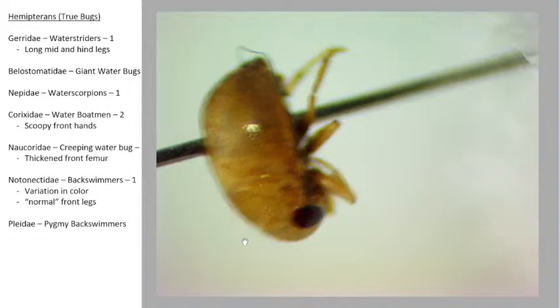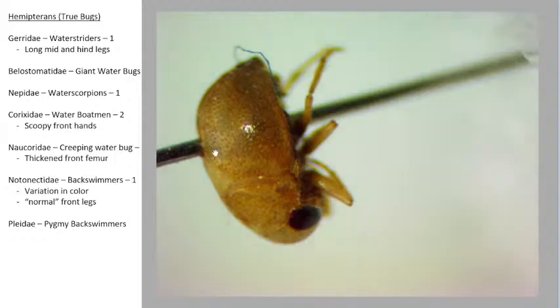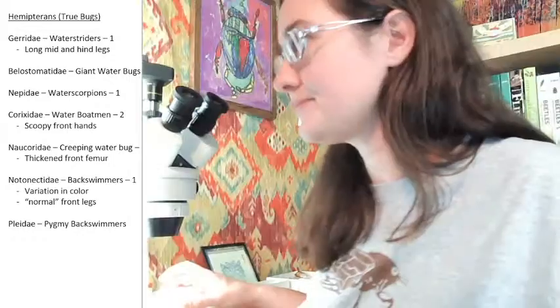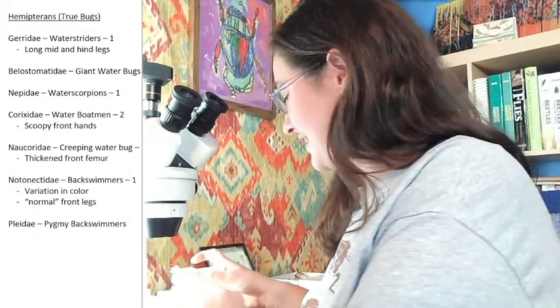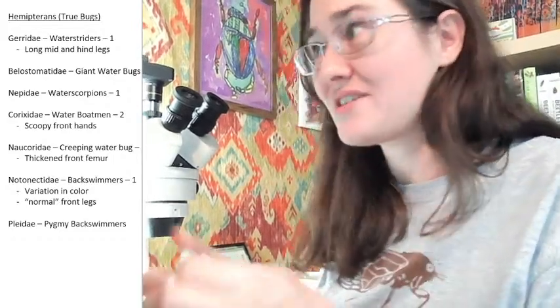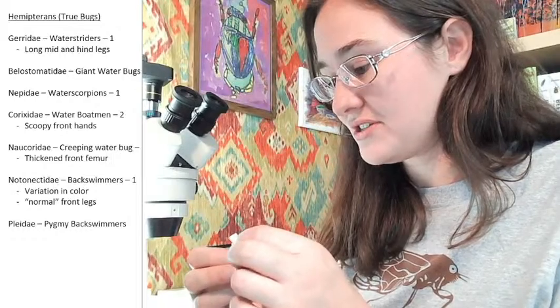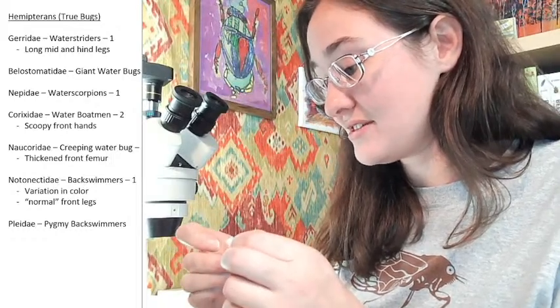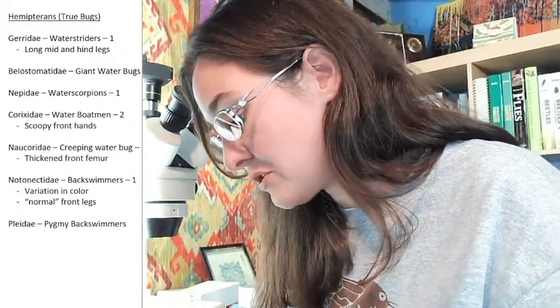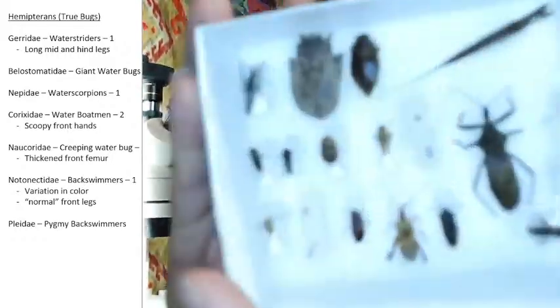I also did this one a while back, so this pin I would have put a little further up. If you wanted to look at that guy in comparison to everybody else, to see the size difference between this pygmy back swimmer and all of the other guys.